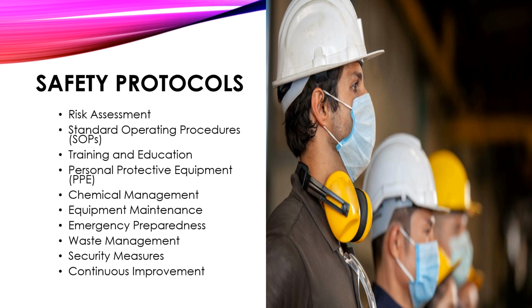Training and education. Providing comprehensive safety training and ongoing education for laboratory staff regarding proper handling of chemicals, equipment operation, emergency response protocols, and adherence to safety guidelines is very important. This also helps to prevent costly errors and mistakes, and helps to reduce costs of operations.